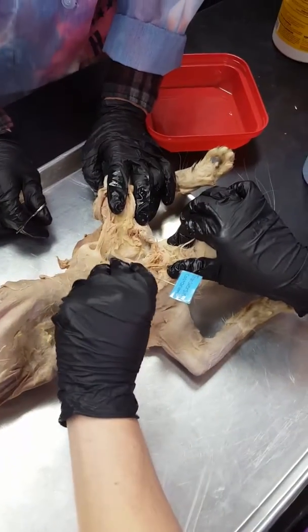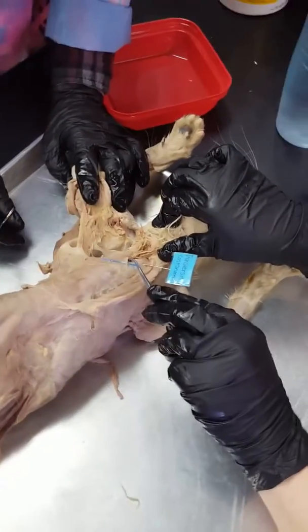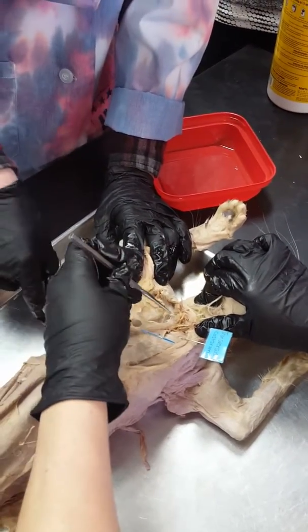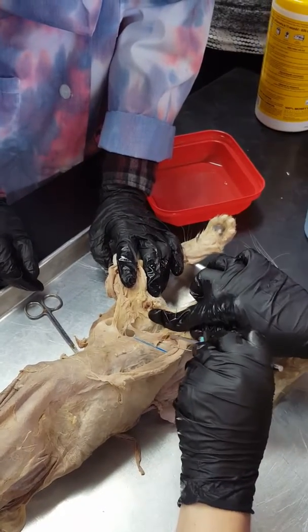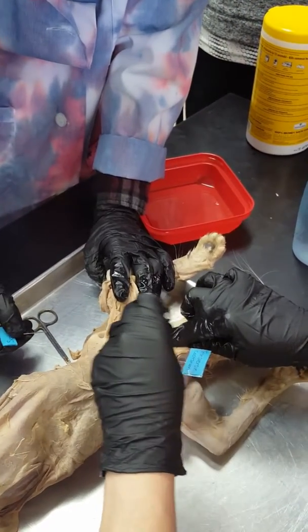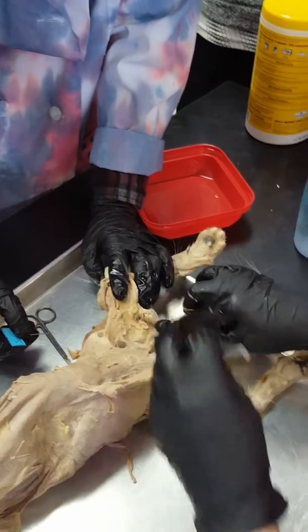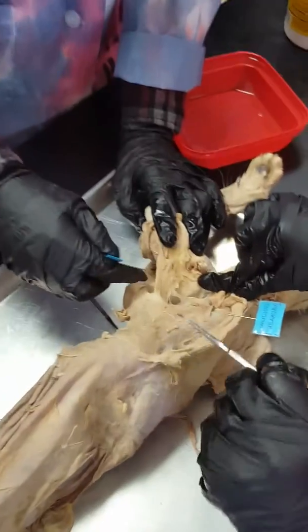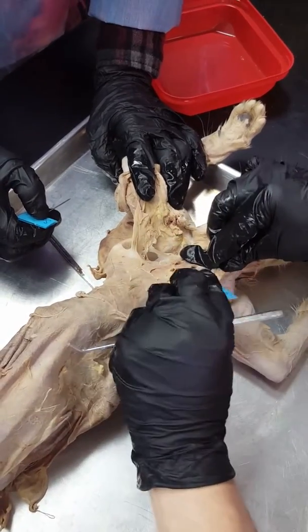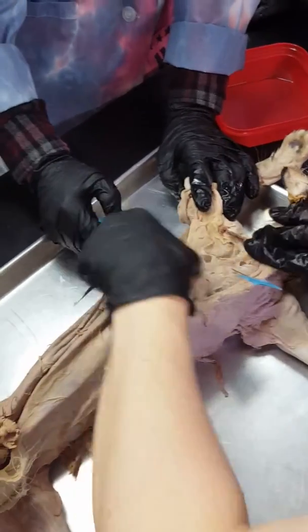Transversus costarum is going to be adjacent to scalenus. It looks like a turkey foot if you clean it up at the top. There's one piece — see that little nubbin, that's like one of the paws — and then there's the long one. Here's transversus costarum, and then scalenus is right here. There was still goo in the way and I couldn't see it.